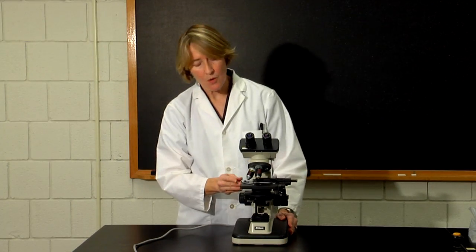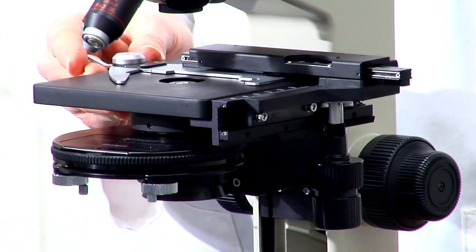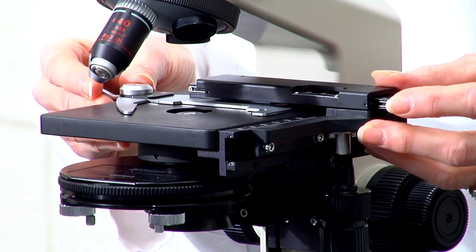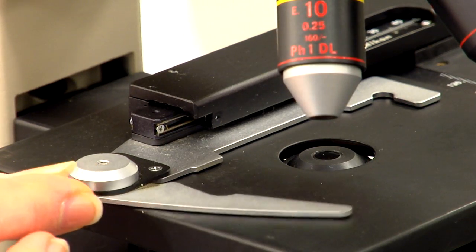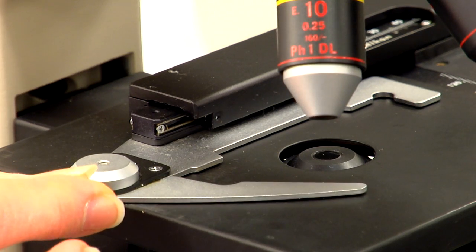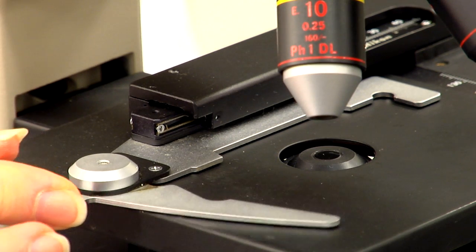Above the light source is the mechanical stage, which holds the specimen and which allows you to adjust the position of the slide. Notice that there's a metal clip. You should put the slide in the clip and make sure that the slide is secure.